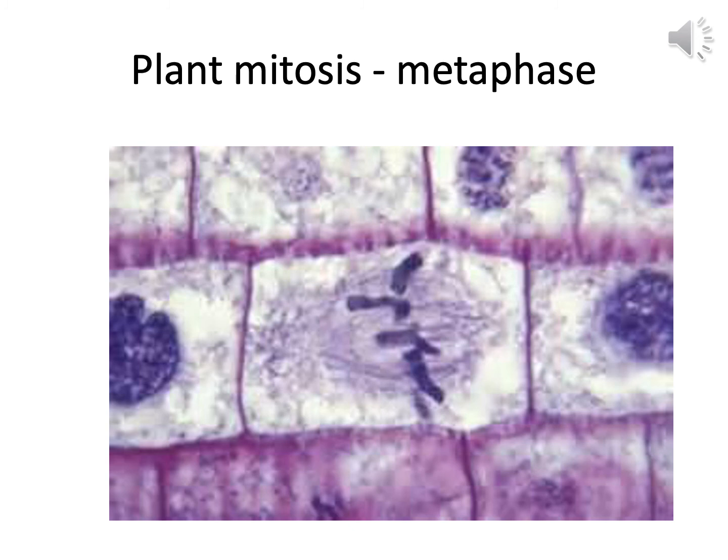I stole this slide off the internet. Somebody had a good microscope with some really nice resolution. But you can see the chromosomes are lined up fairly well in the middle. Sometimes the plant chromosomes are a little long and they don't line up exactly precisely in the middle.